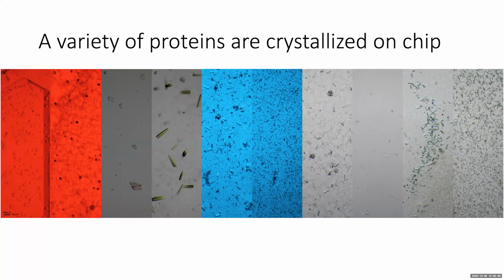Okay, so I have another question for you, quite technical. You are using Z-cut quartz in a certain orientation, I understand, and how difficult is it to get this crystal in this orientation, and how about radiation damage? Can these cells be reused, or is this a one-time deal? Okay.